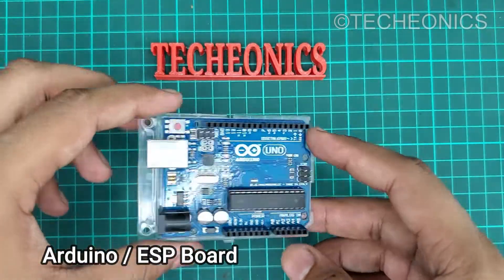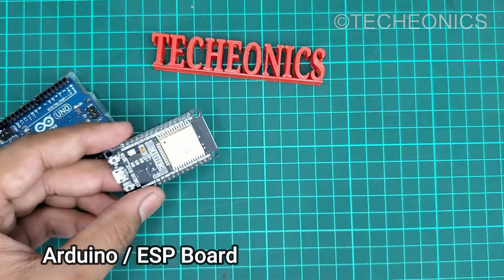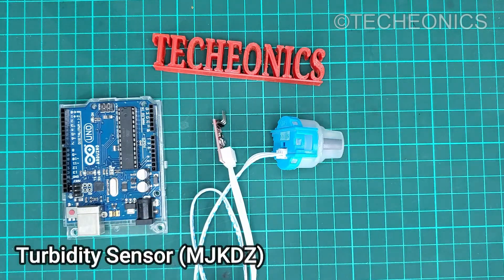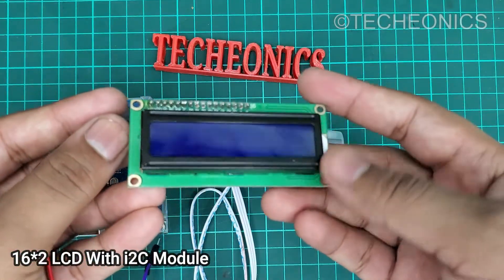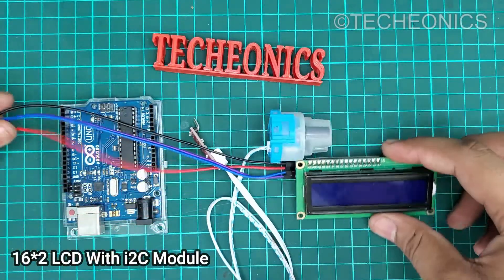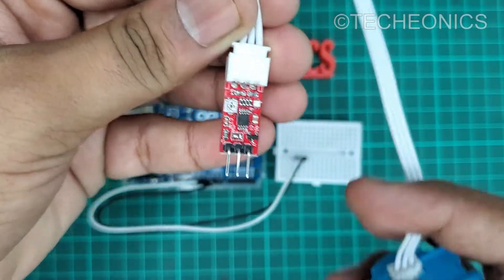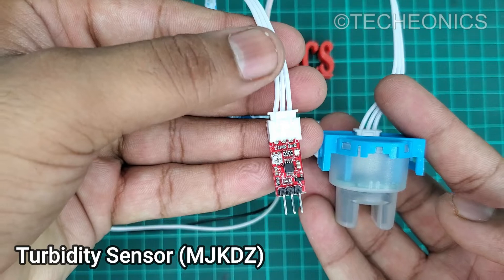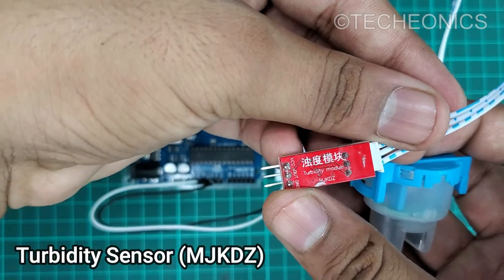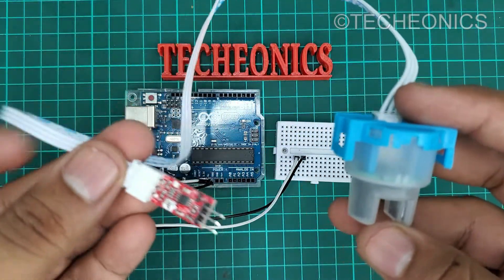First of all we need the Arduino Uno or any other Arduino board. You can also go with the ESP8266 or the ESP32, and then we have the turbidity sensor and then we have the LCD module with the I2C module on it. These are the parts we need for this project. The model number we are going to use is MJKDZ turbidity sensor. You can also go with the DF Robotic turbidity sensor as well.